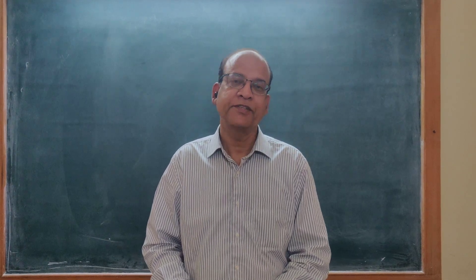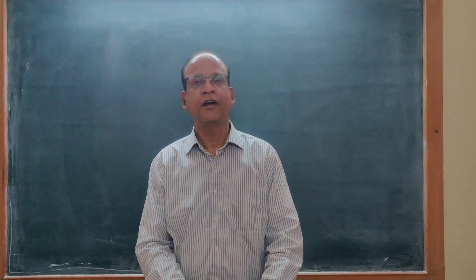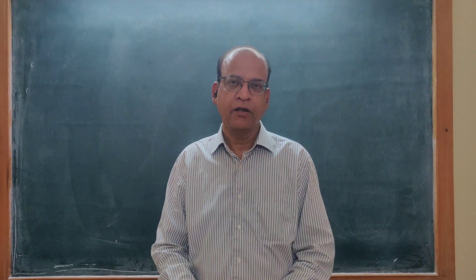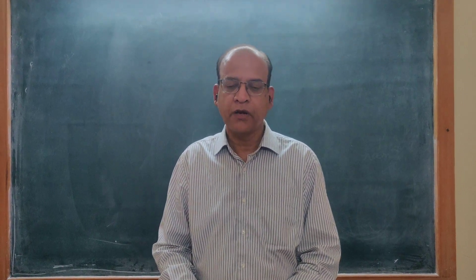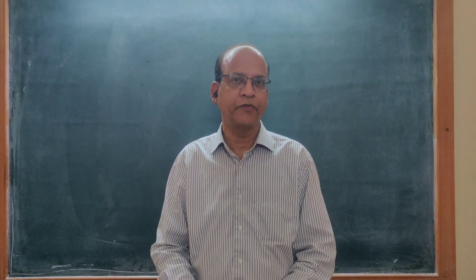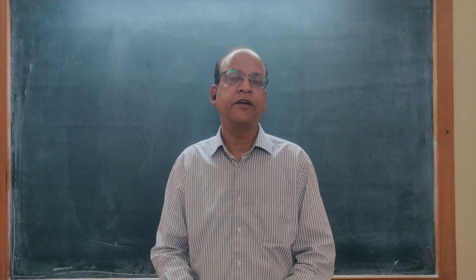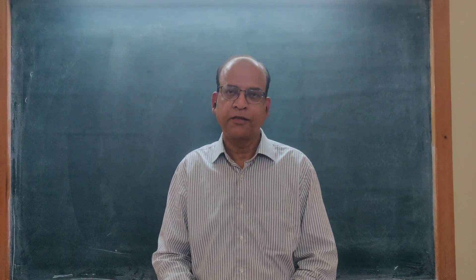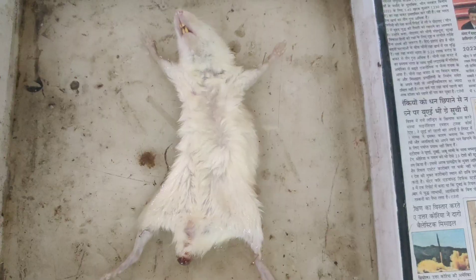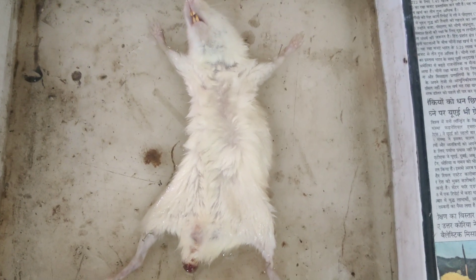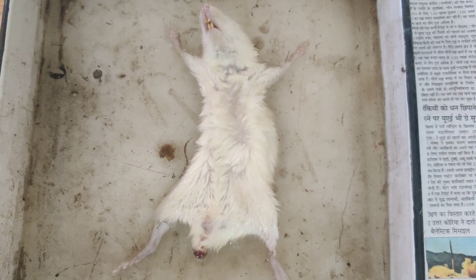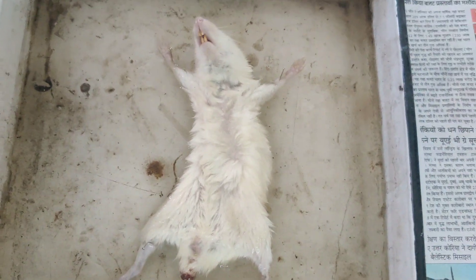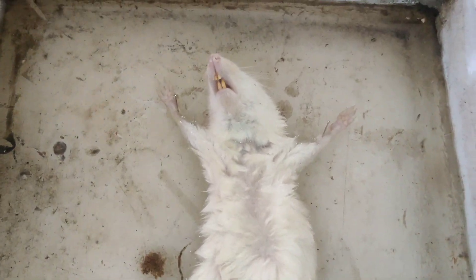Hello, welcome to my YouTube channel. Today we are going to have a dissection of a rat to study its internal body. So let us start the dissection. I have fixed the animal in the dissection tray, already pinned.